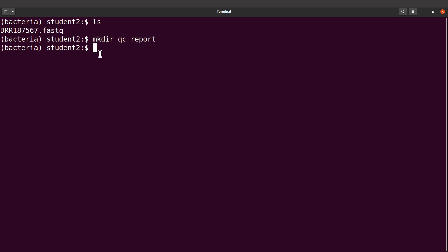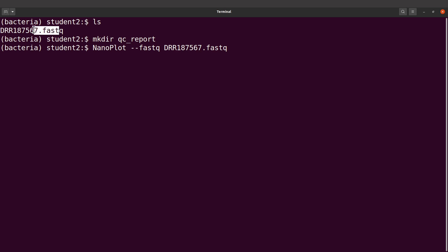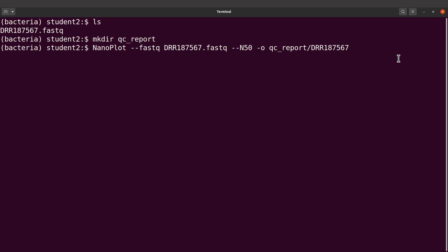Now what I'm going to do is assess the quality of the raw reads using NanoPlot. So to use NanoPlot we call it and then specify the fastq file. We also need to specify the flag to show the N50 mark. I'll save the output to qc_reports slash the sample name, and then add underscore_raw to differentiate it from the filtered QC report we'll create later. Let's execute this command.